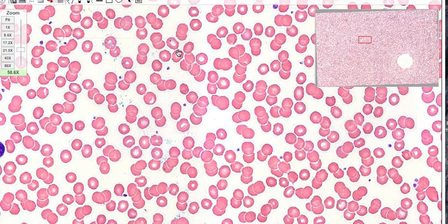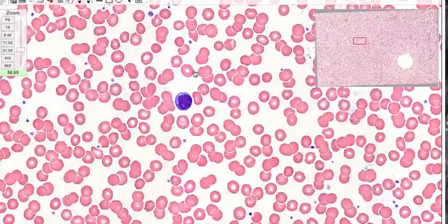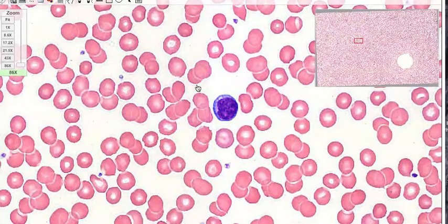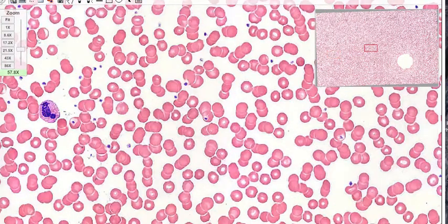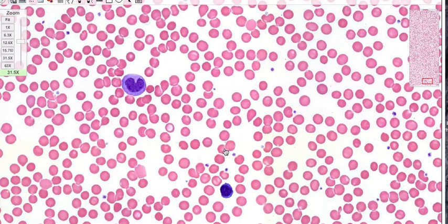The other cells we looked at are monocytes. Here's one here, a monocyte. Monocytes, neutrophils, lymphocytes, which look very similar to monocytes. Sorry, this is a lymphocyte, remember, because it doesn't have that peculiar curve within the nucleus. So this is actually a lymphocyte, whilst the monocyte, if I can find it just quickly, had the curve. There it is. The monocyte typically had the curve in the nucleus, and our T and B helper cells.